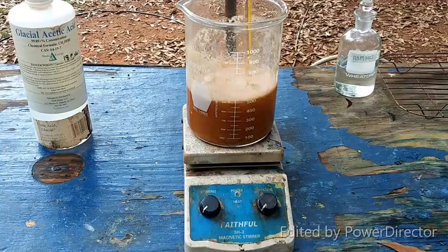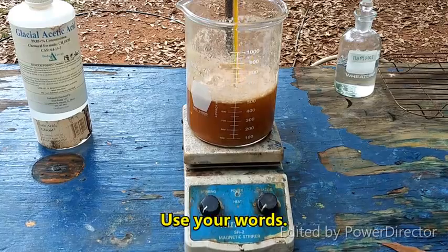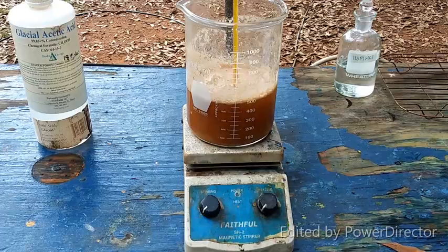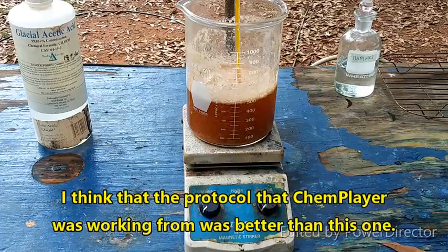Yeah, I think I see why this method has you get the rest of the anthranilic acid out of the filtrate by precipitating it as copper anthranilate, because this procedure ends up where there's a good bit of liquid by the time you're done.